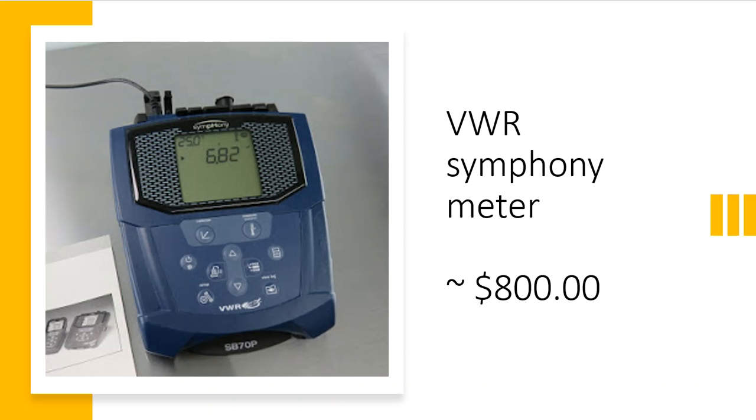What we have in our laboratory, though, real pH meters, are these VWR Symphony meters. And the Symphony meter they thought was pretty clever because, look, they put pH into the middle of the name, right? These meters are a little bit more expensive. That's because they're better meters, and I'll talk about that in just a second. But these things run for about $800 a pop. And the probes that get attached to them do go out and they do go bad. So we have to replace those as well.